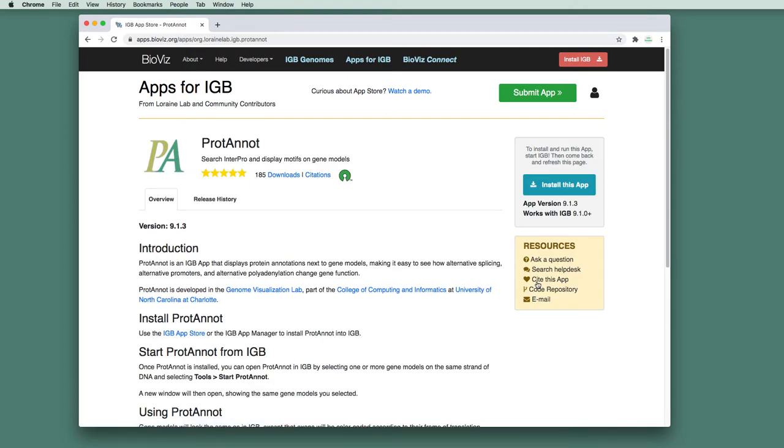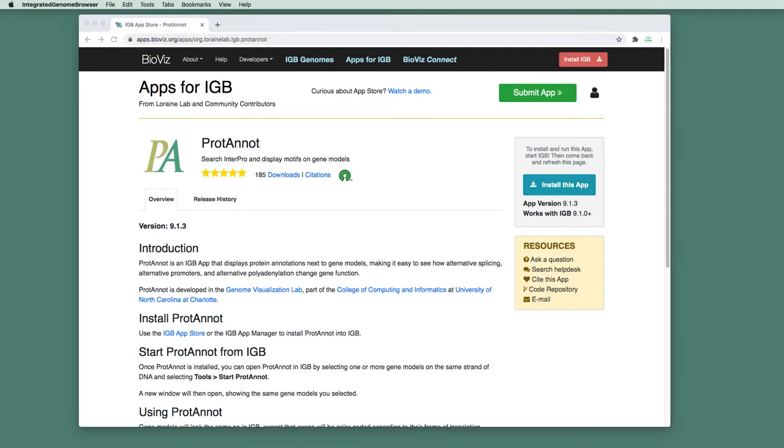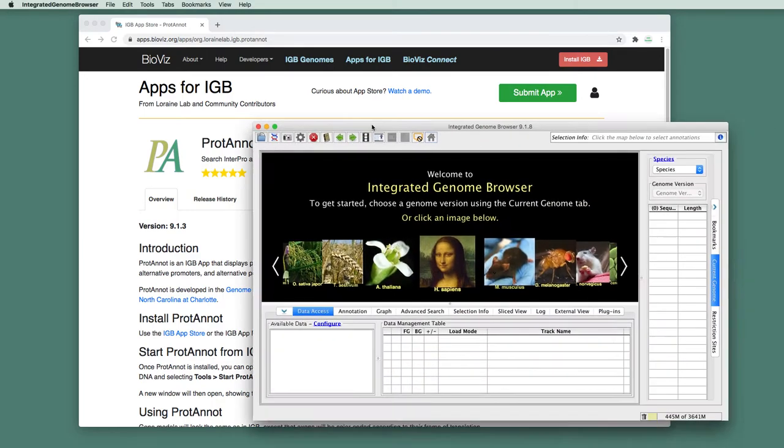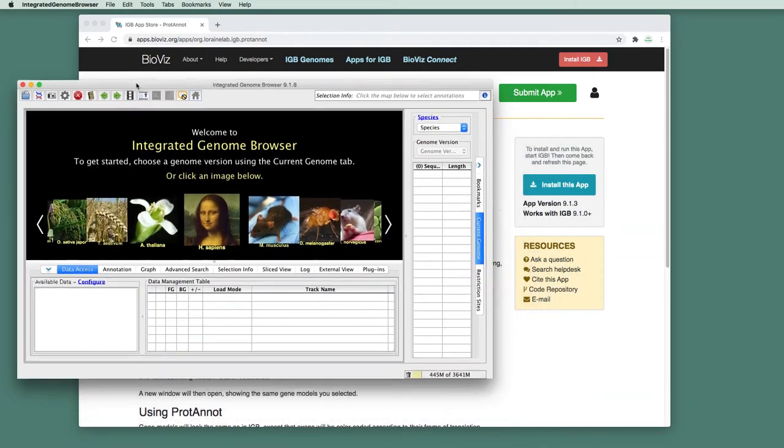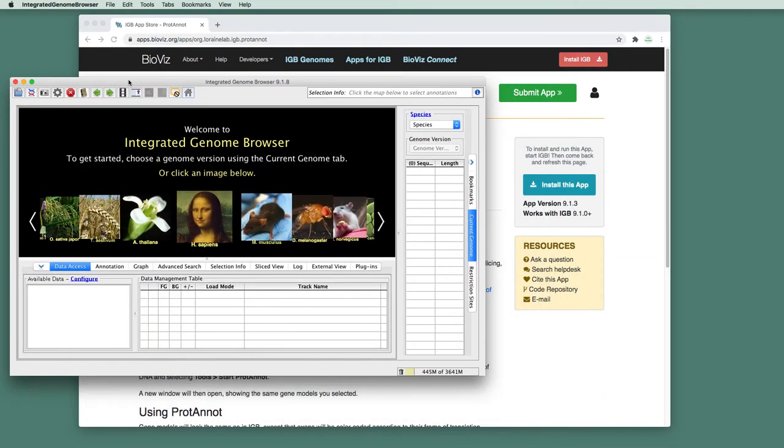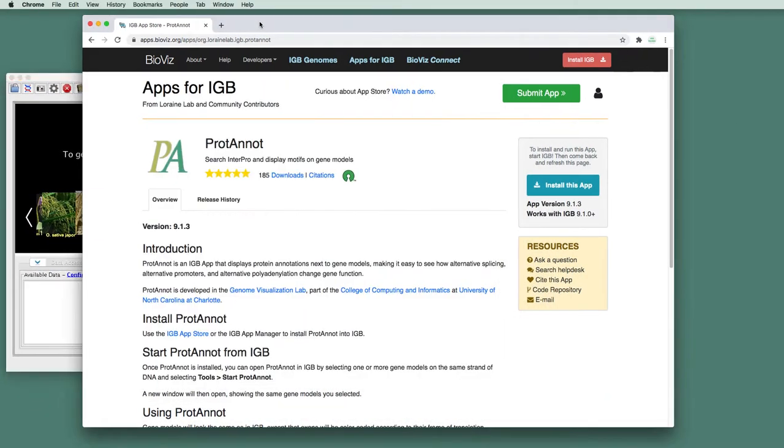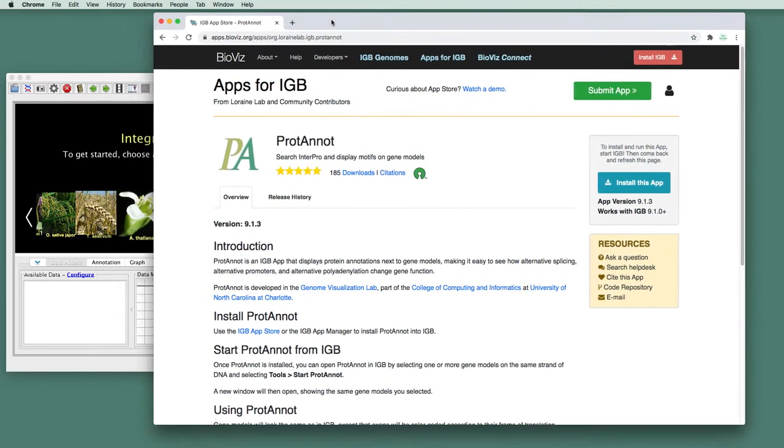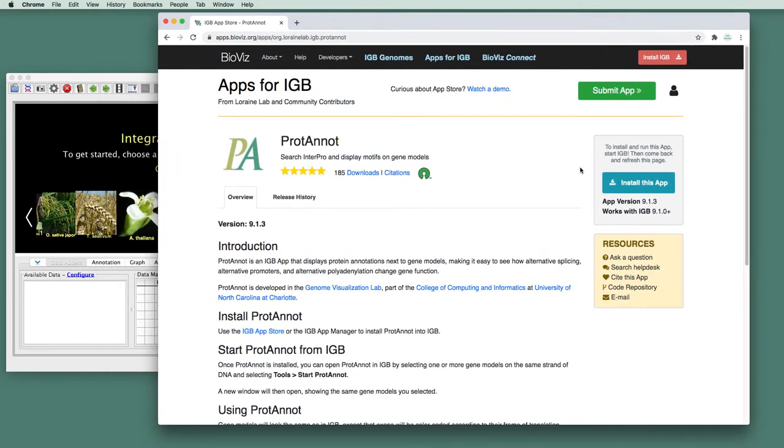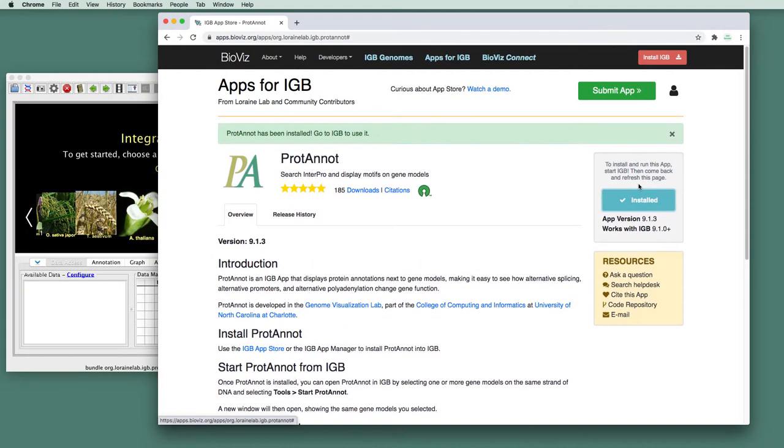Here's an example. And if IGB is currently running, you'll see a button here on the right that says Install this App. So let's just see how this works. So here's Integrated Genome Browser running on the desktop. And we click Install this App on the web page.